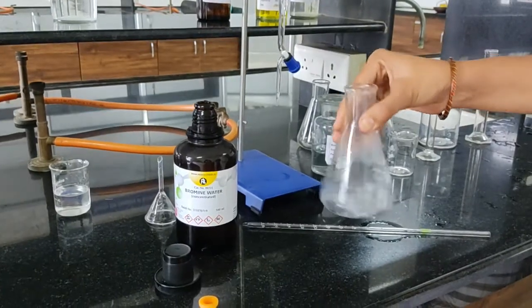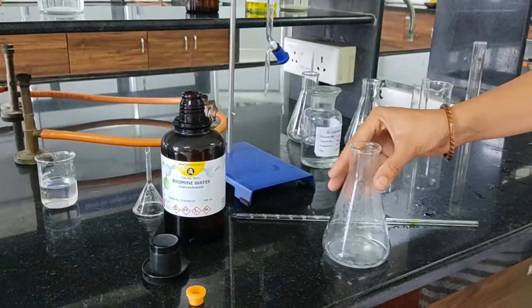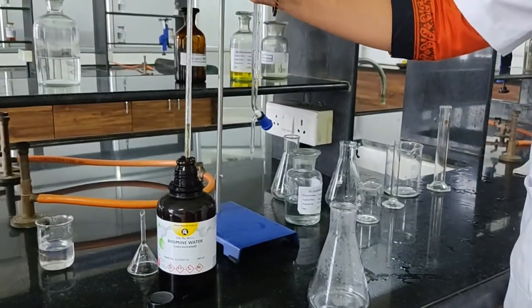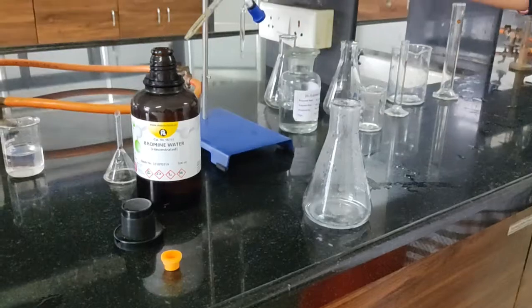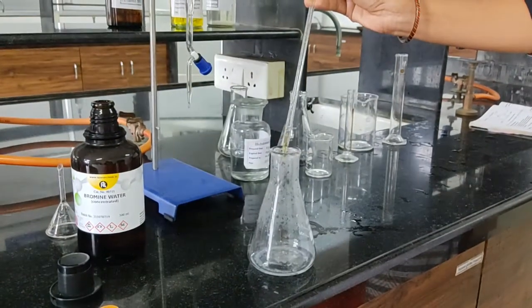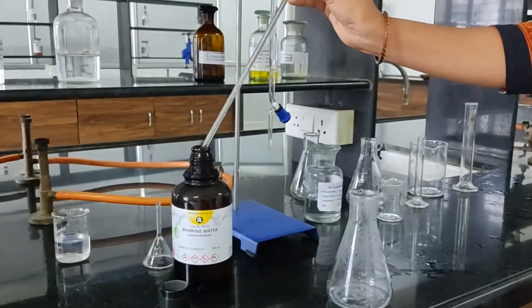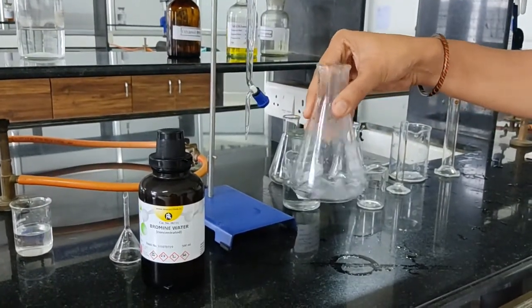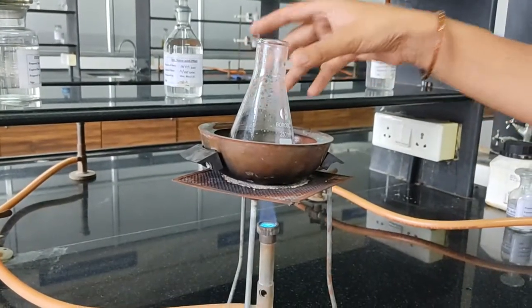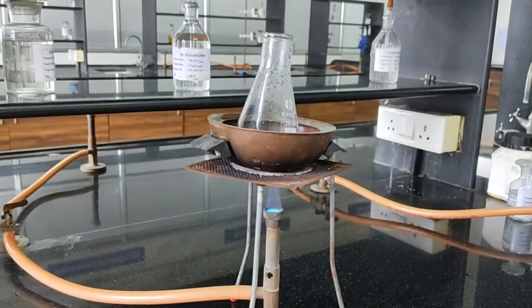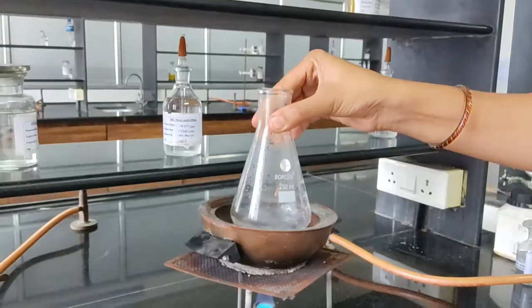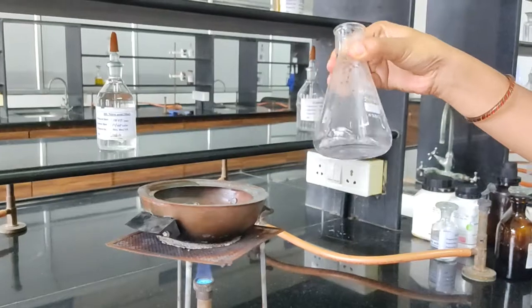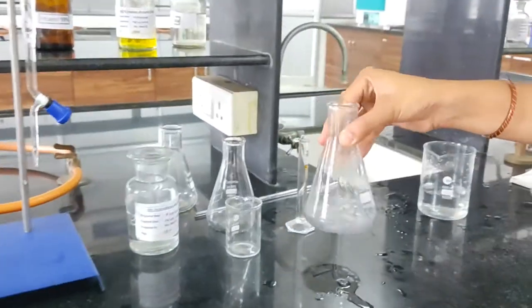Now add 0.1 ml of bromine water into the solution. After addition of bromine water, we have to heat this solution so that excess of bromine gets evolved. Heat for few minutes so that excess of bromine gets evolved. After boiling for 10 minutes, cool this solution in water bucket. Now our solution is cool.